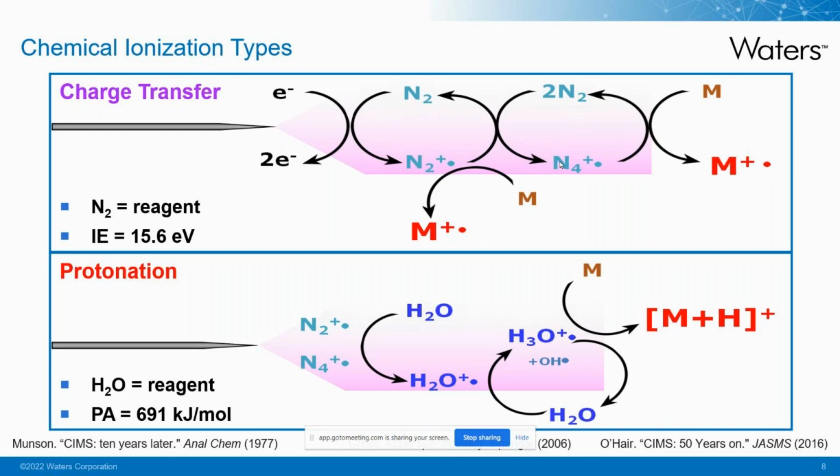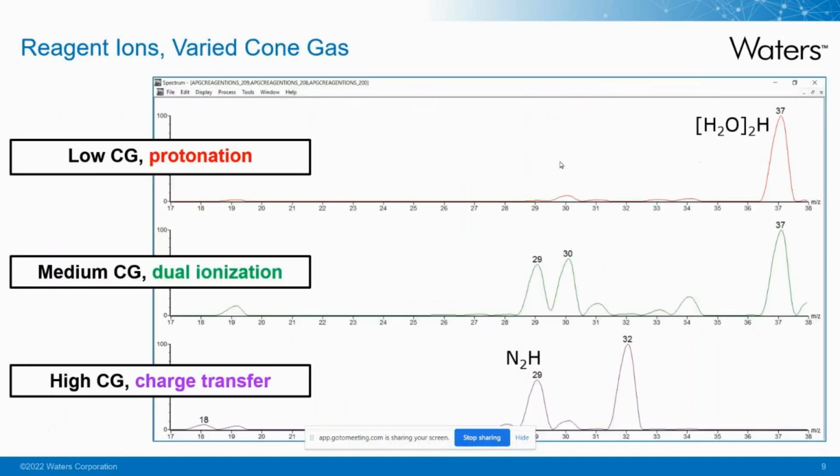That's why I have the references across the bottom, across the kind of over 50 years of chemical ionization references. You'd find charge transfer, also referred to as charge exchange, all the way back into the 60s and fundamental studies by Munson and Field. So nothing has been invented in terms of the ionization type here, but it wasn't commonly used in vacuum source systems. And again, remember there's 300 mL per minute of nitrogen as the reagent species here, which isn't really compatible with a vacuum source system. So that's one of the contributing factors to charge transfer being maybe a little less familiar for GCMS people.